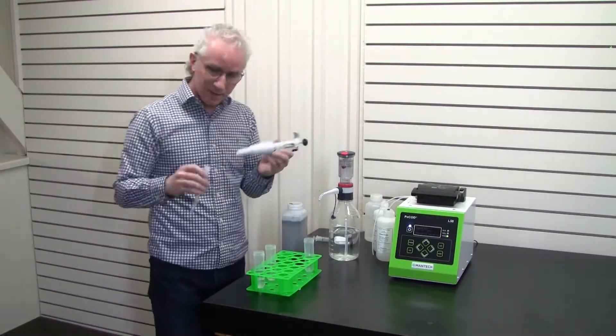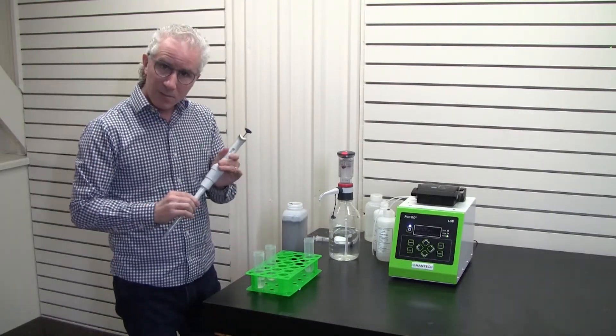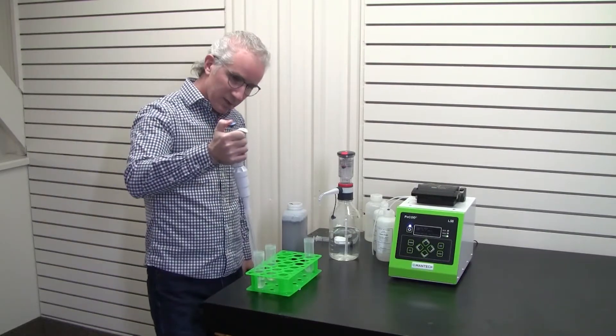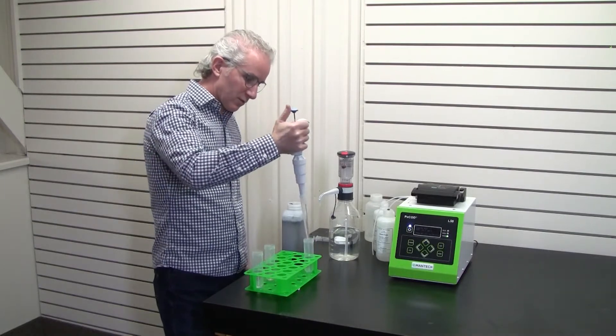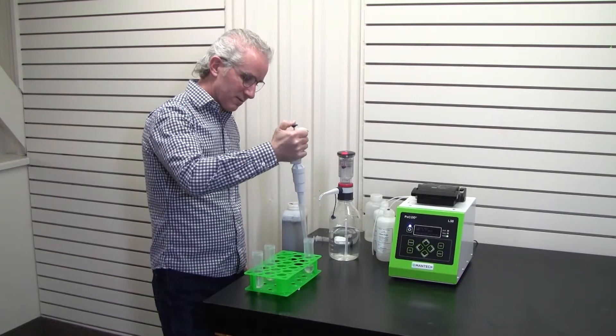I'll use the pipette, which we also provide in the starter kit. Since it's the green range, we take 10 mils of the sample — in this case the pre-diluted sample — and that's the volume we're going to use. Depress the plunger, bring it in, draw up the 10 mils, transfer over to a clean tube, and push it up. Very easy.